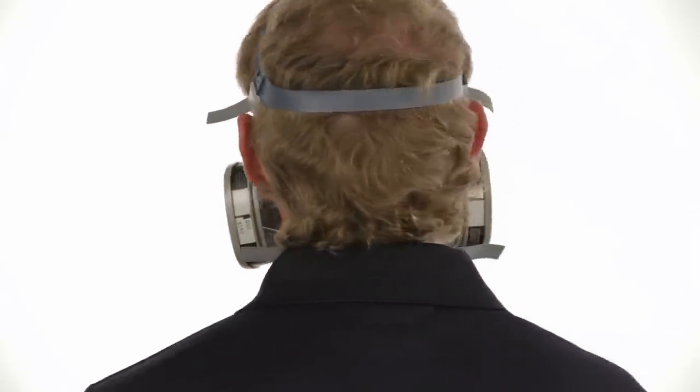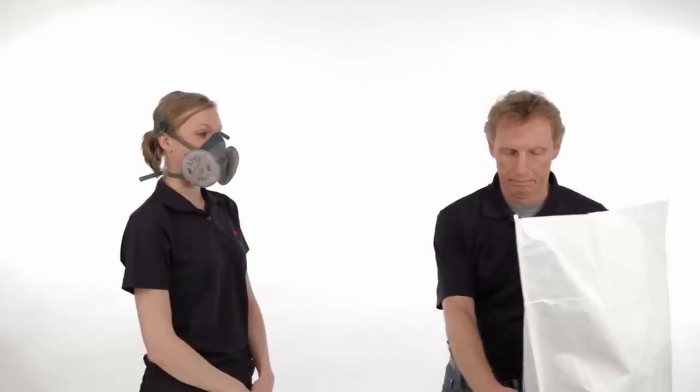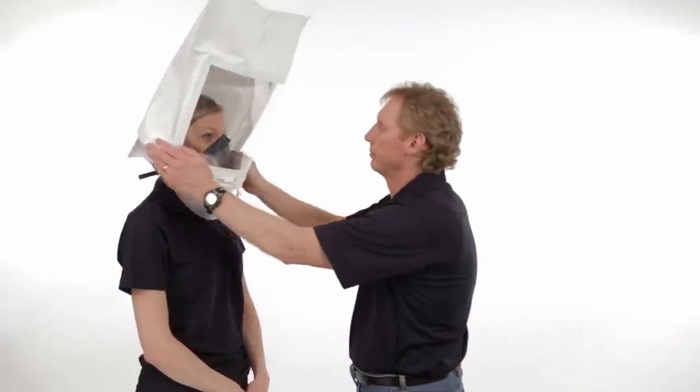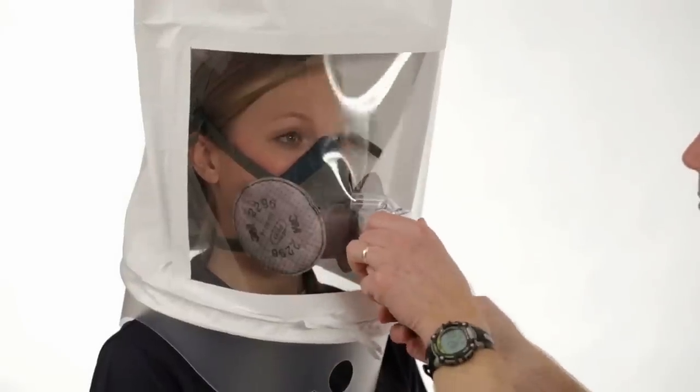It is critical that all edges of the respirator are flush against your face. If you have a beard or other facial hair, or any other condition that interferes with the face seal, you cannot use the face pieces featured in this video. An additional segment demonstrates fit testing your respirator. In the US, OSHA — the Occupational Safety and Health Administration — requires fit testing to ensure that your respirator fits properly.